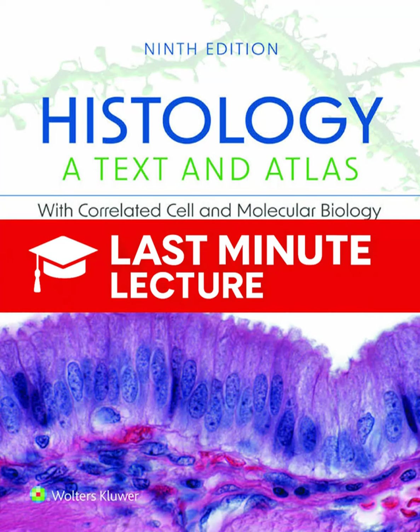Figure 1.1 shows an amazing visualization of this. It does. It shows a single DNA molecule lying on a mica surface. You can see the strand itself, and where binding proteins are attached, they create these little thickenings or bumps. AFM provides a way to visualize macromolecular interactions in real time in a natural physiological environment.